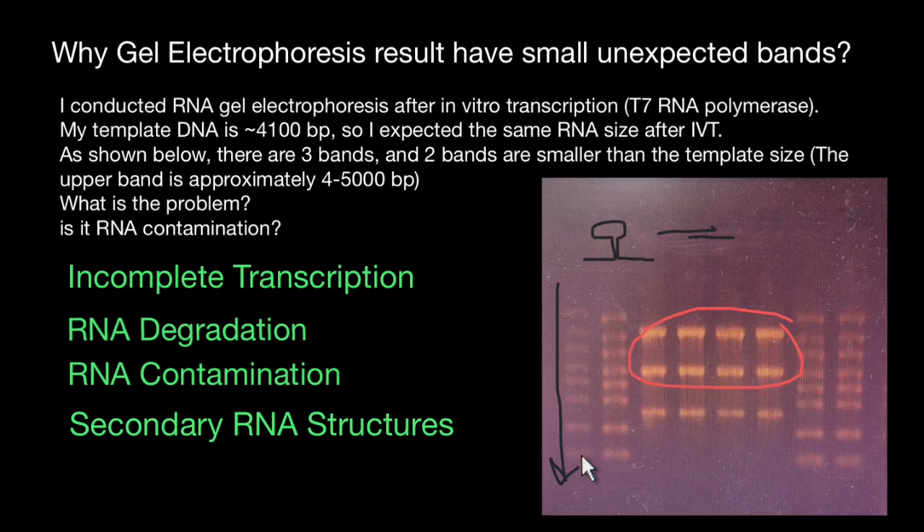Another reason can be transcription errors. Occasionally, T7 RNA polymerase can introduce errors during transcription, resulting in shorter RNA fragments. While this is the least common cause, it can occur. Optimizing transcription reaction conditions and using high-quality enzymes can help minimize the occurrence of transcription errors.